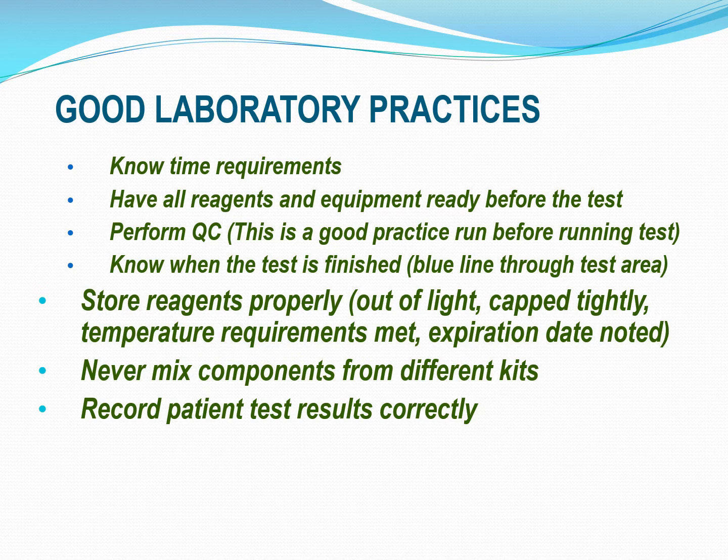You always want to make sure you store your reagents properly. A lot of them need to be kept out of light. You always want to make sure that you put the caps back on tightly and that all temperature requirements are met, and you always want to note expiration dates. Never mix components from one kit to the next. If there's some reagent left over in one kit, you never want to just move it to another kit. All of those need to be properly disposed of, and then you open up the new kit and start over from there. And then you always want to record your patient's test results correctly on the correct patient.